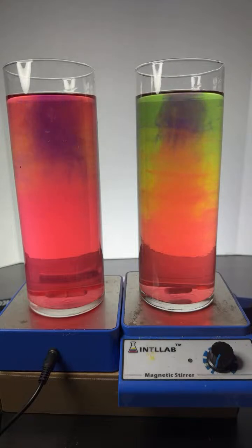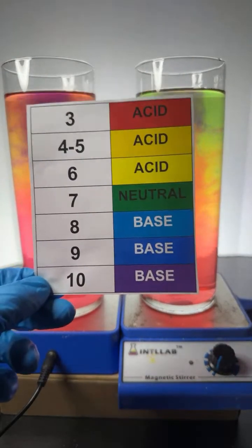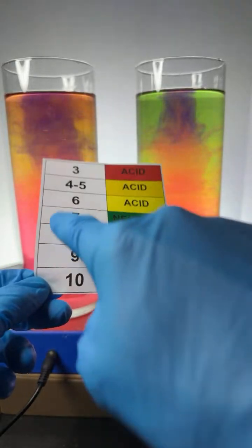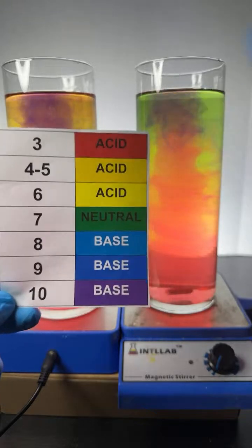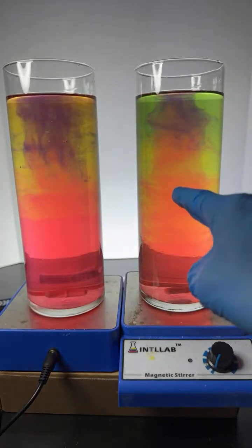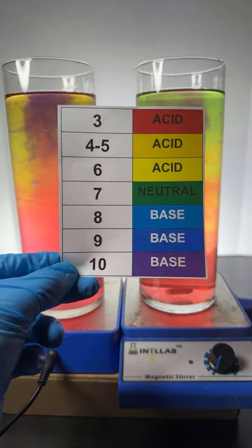Rainbow indicator is also known as universal indicator. It displays these colors at different pH values. pH just tells you how acidic or basic something is. So where you see green in these flasks, like up here and over here, the solution is neutral. Where you see red, like through here, it's going to be quite acidic. The lower the pH value goes, the more acidic it gets.